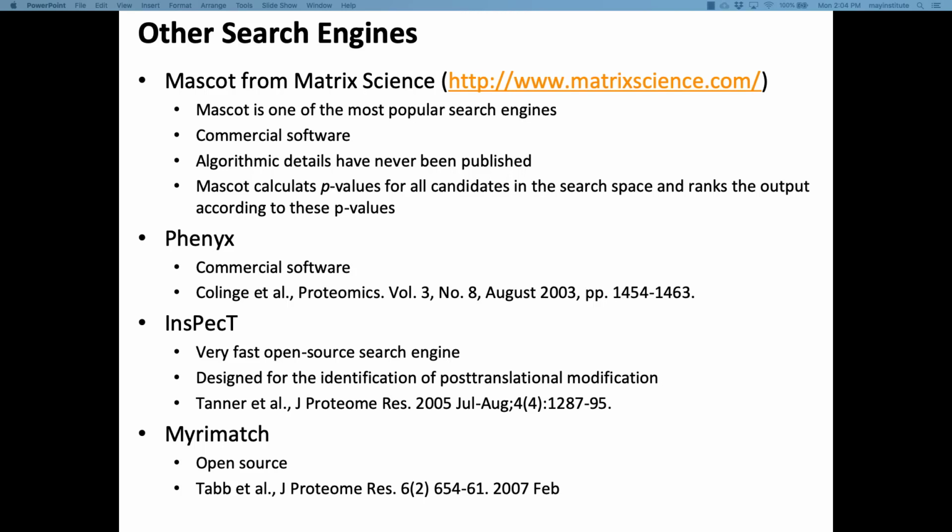It depends. It really depends. I think we can discuss that offline. I like MSGF+, we use it a lot, but we've also run into trouble with it. But my recommendation is just give 2 or 3 search engines a shot, and we will actually show you how you can do that without too much pain, because in OpenMS you can just plug them in and out.